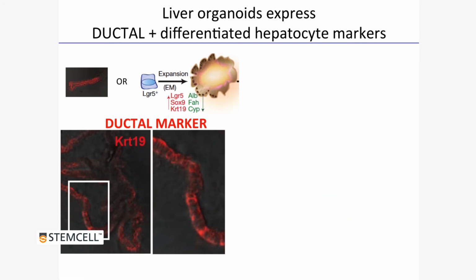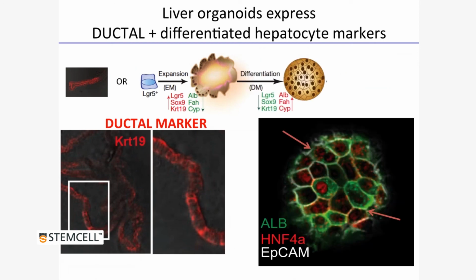When we transfer these cultures into a differentiation medium in which we inhibit Notch and TGF-beta signaling, this columnar epithelium changes into a pseudostratified epithelium, and the cells are not columnar anymore but show a very nice polygonal shape, and they start expressing the markers of the hepatocyte lineage. Even more interesting, some of the cells even acquire a binucleated phase, which is a mature final fate of hepatocytes.